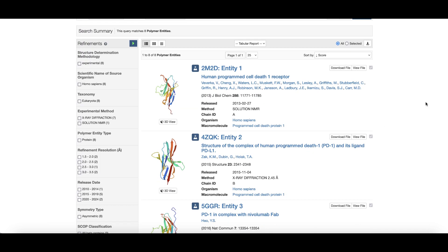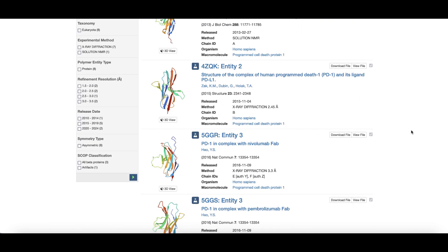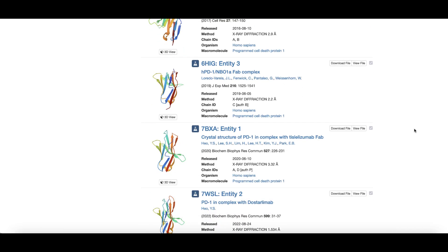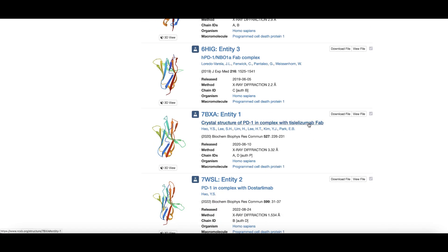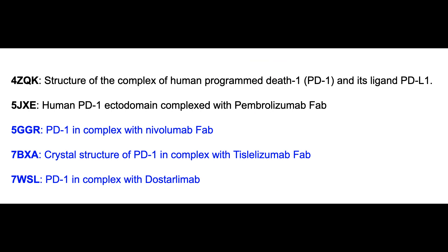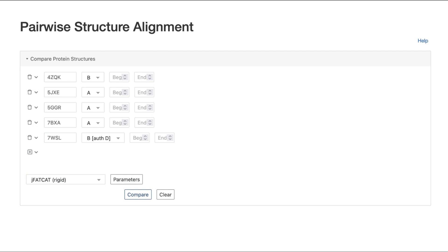Besides pembrolizumab, there are PD-1 structures bound to nivolumab, tislelizumab, and dostarlimab. Let's note their PDB IDs.